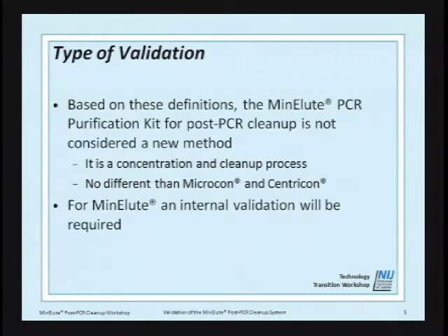So based on these definitions, the MinElute PCR purification kit for post-PCR cleanup is not considered a new method. It's a concentration and cleanup process. That's basically all it is. It's no different than the microcon and centricon. For MinElute, an internal validation will be required, so you will not have to do developmental validation on a MinElute.